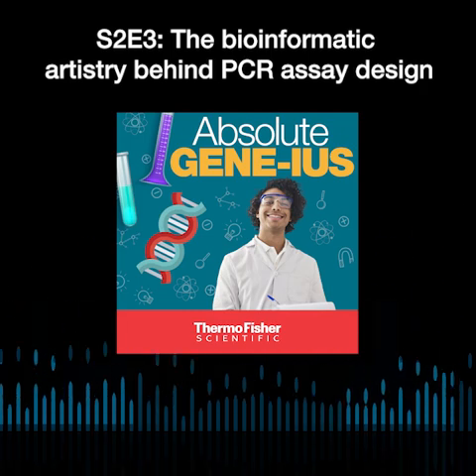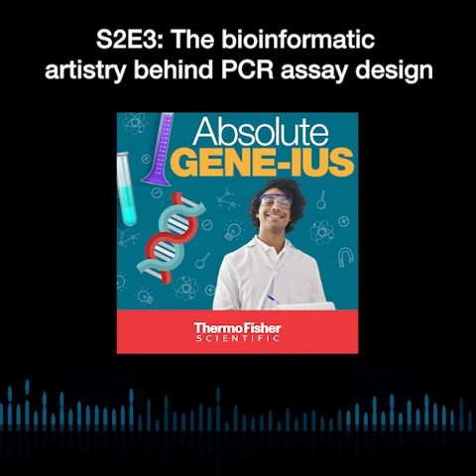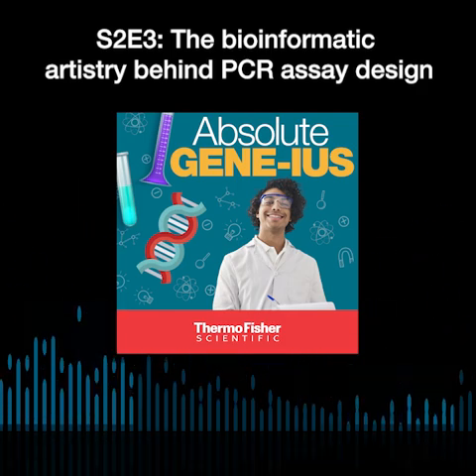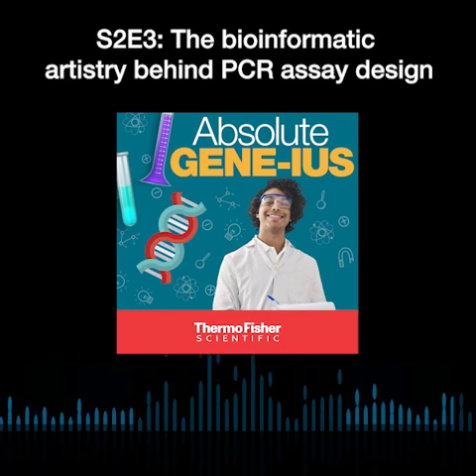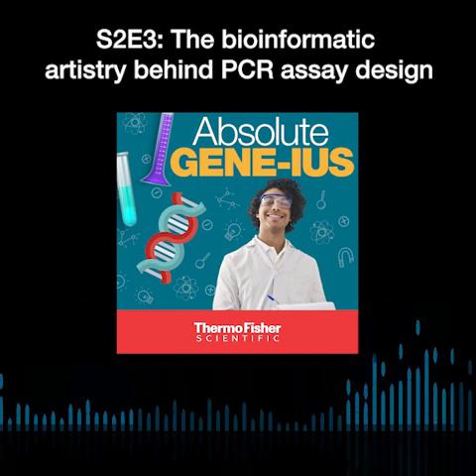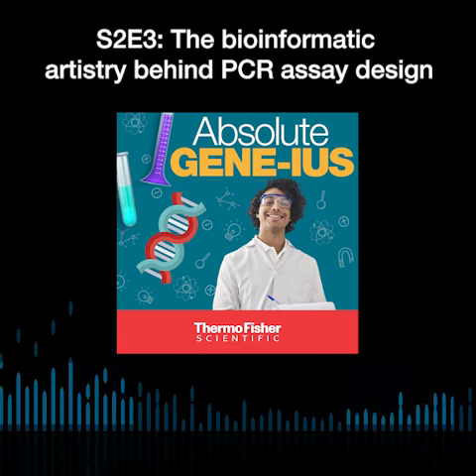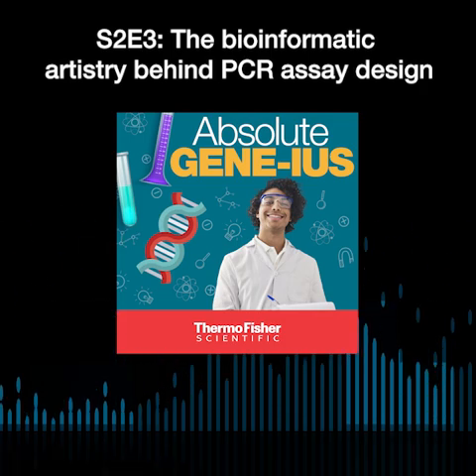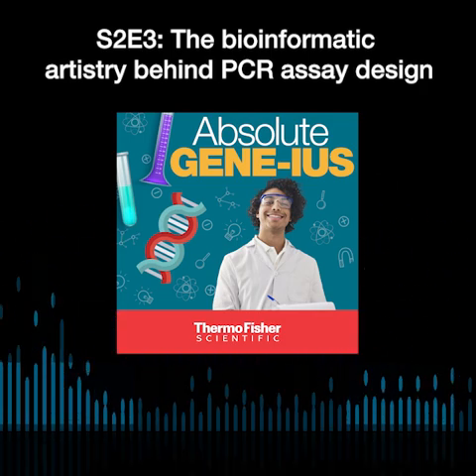It sounds like considerations for digital PCR assays are very similar to some of the considerations for qPCR assays. Is that the case? And are there any differences between designing assays for these two technologies? Even if you design an assay for qPCR, you can try running it on digital PCR and see whether it performs well. A lot of times it will perform well, but there are some considerations for digital PCR.